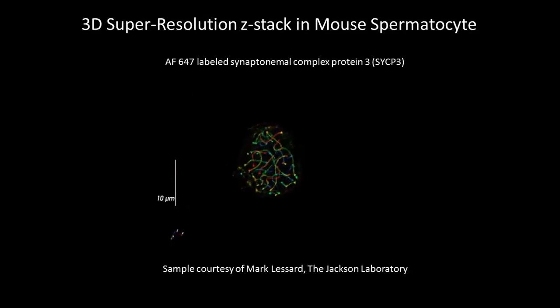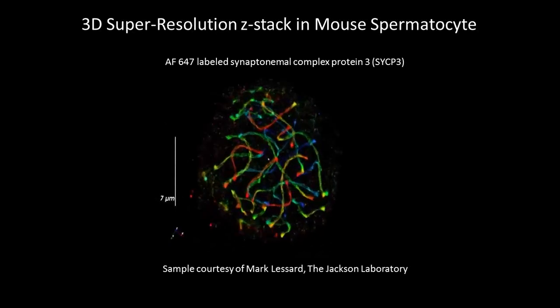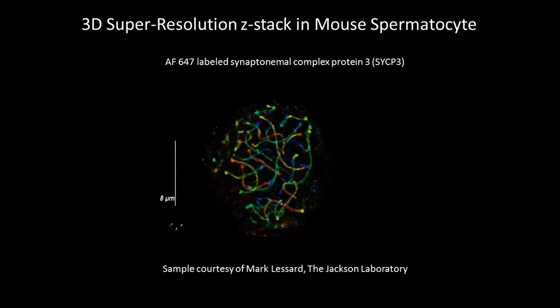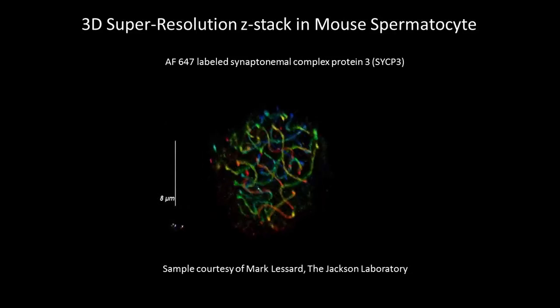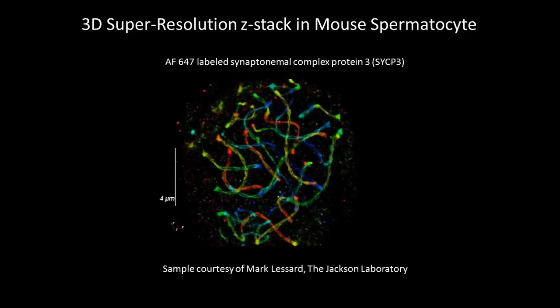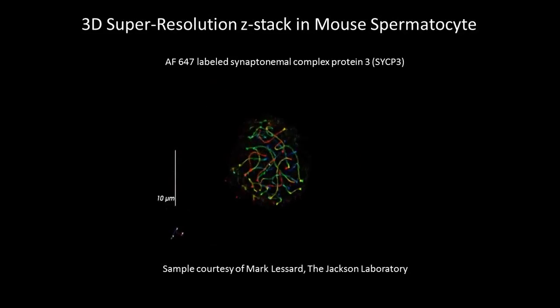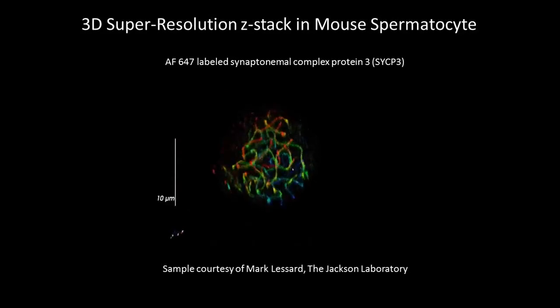Again, Mark, of course, spent a little bit of time optimizing the sample prep, and most of it was what he would have used for confocal anyway. The one thing he was very careful about was the extent of primary and secondary antibody dilution and how he fixed the samples. Those are some things to keep in mind, and post-fixing your samples definitely helps.